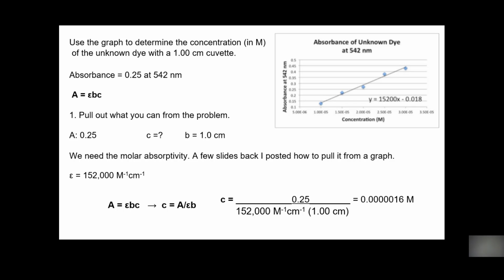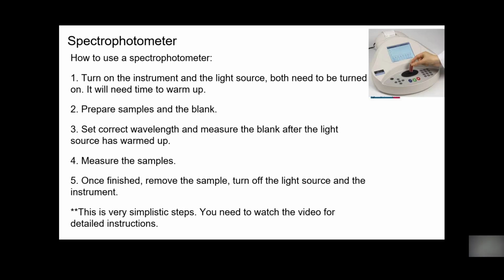Plot it all out. Again, I don't know if this is a problem on LabFlow or not. This is from my prior semester. And again, I didn't use scientific notation, and there was a unit there. So the spectrophotometer, if we were in class, I guarantee you guys we would use this, and this is really not a difficult class. The graphing would probably take more time than the lab itself.